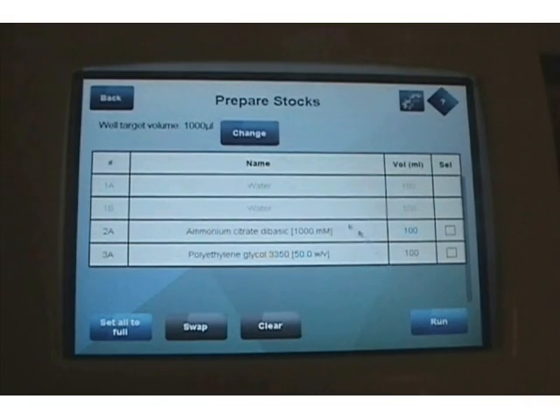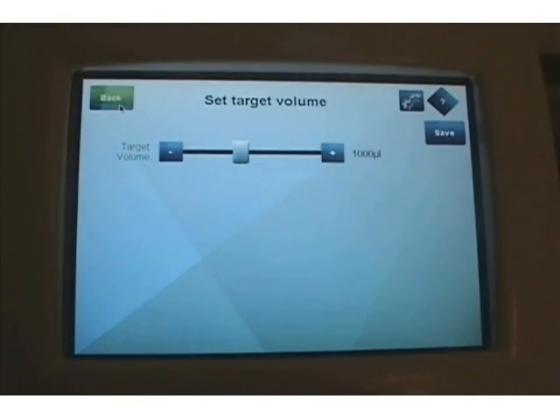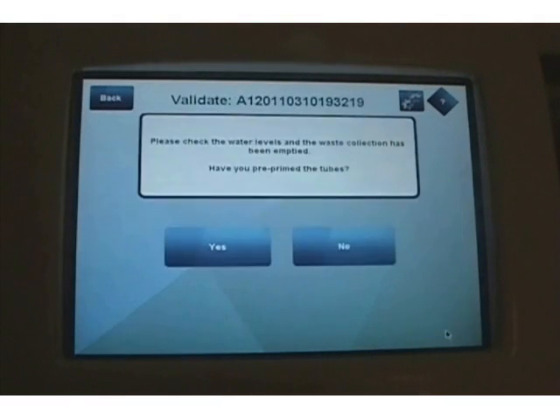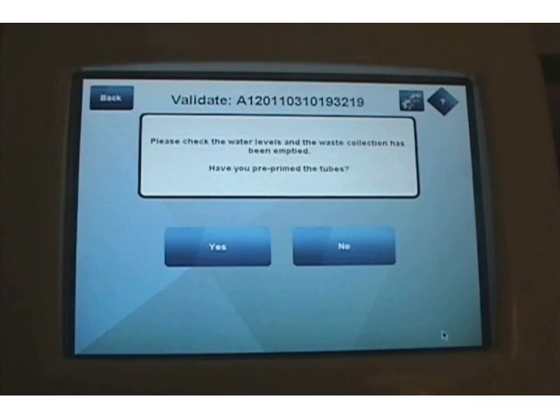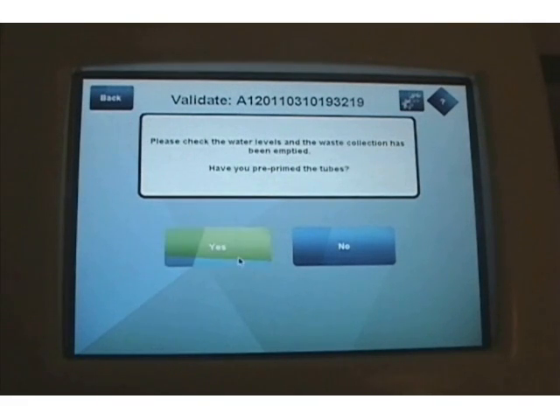At this point, all of my required solutions are loaded on the instrument, and the OptiMatrixMaker knows that, so it produces the Run button in the lower right, indicating it has everything it needs to make the screen. The target volume at the top of the screen is the final volume that will be in each well at the end of the run, and it is editable by clicking the Change button. My target volume is 1 mL, which is what I want, so I click Run. The Validation screen comes up — this is when the instrument compares the screen you designed to the stock solutions you added and the target volume requested, to make sure it is possible to make the screen. If a stock solution is not concentrated enough, or if the pH range of your buffers is not wide enough for the pH gradient programmed, the instrument will let you know what needs to be changed. In this case, it just asks if the solutions are primed. I did that already, so I click Yes, and the production begins.